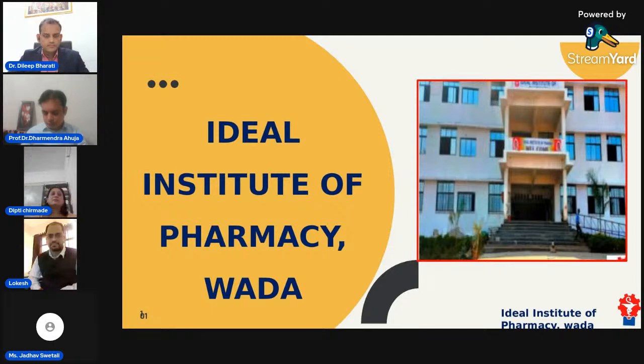My dear students, the Pharmacy Council of India has issued a notification, and as per that notification, wherever animal experimentations are prescribed in the curriculum, the required knowledge and skill should be imparted by using computer-assisted modules. This is why we have taken the initiative to organize this webinar, which will help you become aware of computer-assisted learning of pharmacology experiments. Today's presentation will address the experimental techniques in pharmacology using software.